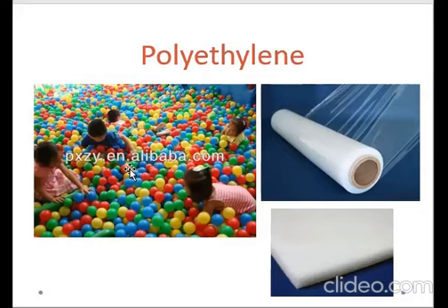But again, I'm not saying na purely polyethylene or yung kanina na examples, purely polystyrene yun sila. Okay? So ngayon, I want you to remember na hindi ito sila purely plastic lang. So may mga dinagdag pa dyan na other chemicals.